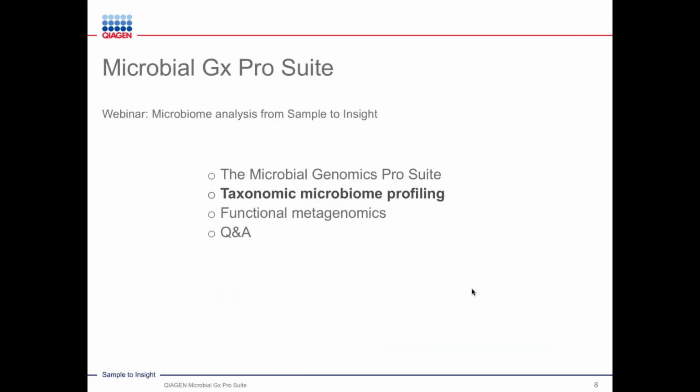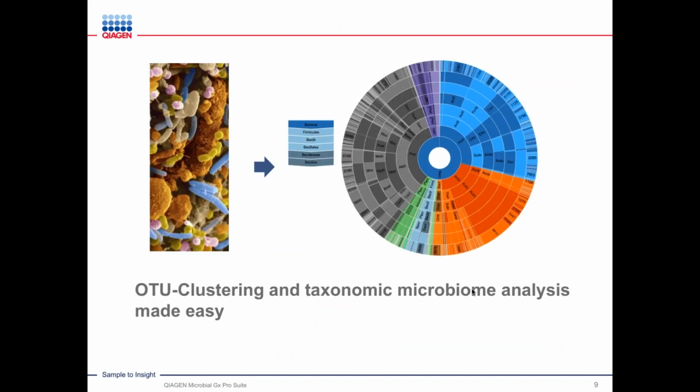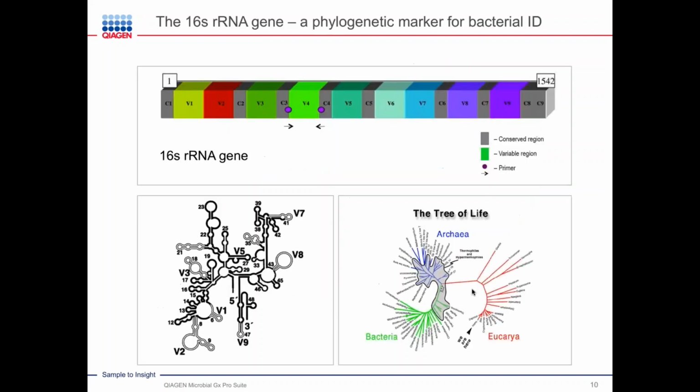With that, we'll dive into the presentation of the taxonomic microbiome profiling workflow using 16S data. We use an approach referred to as OTU clustering for this, and I'll walk you a little bit through what OTU clustering means for those of you who are not familiar with this.